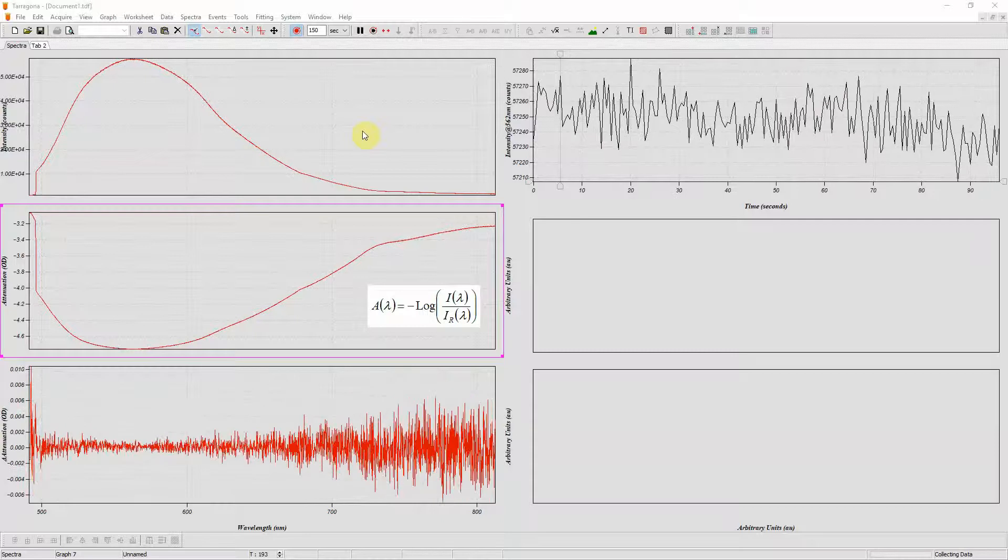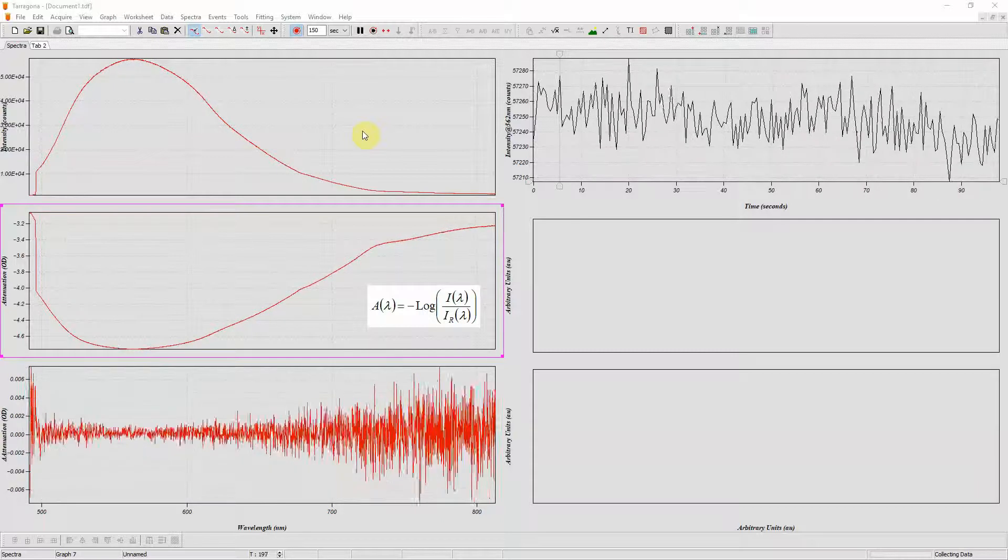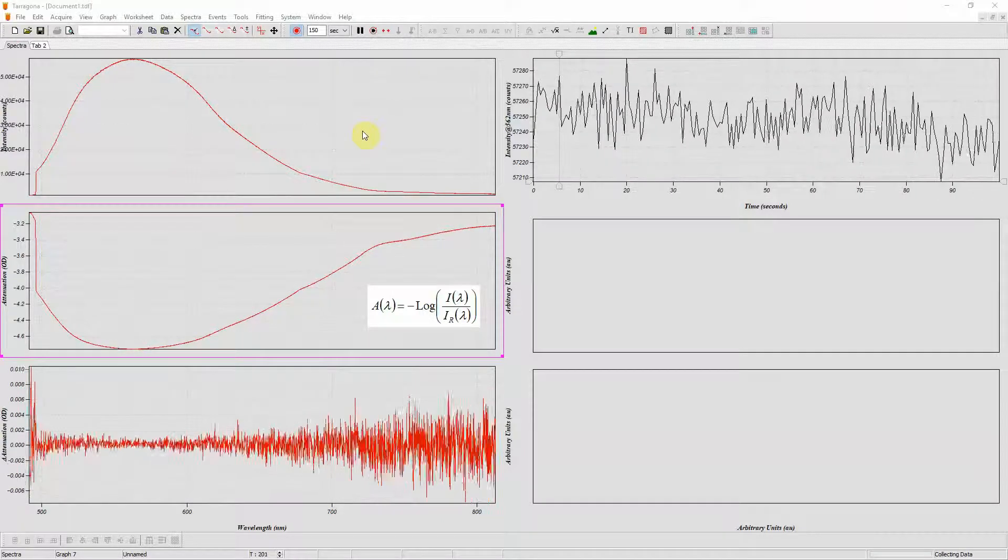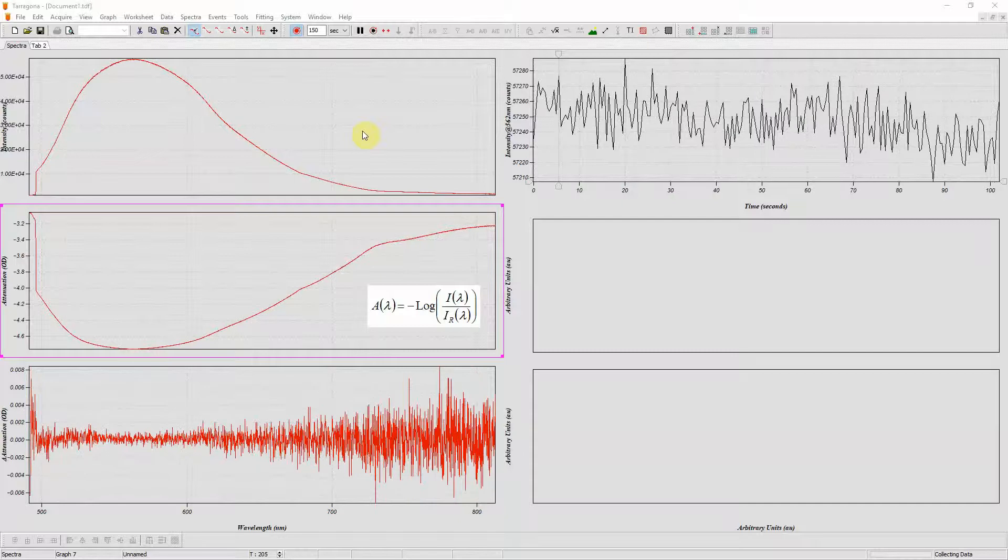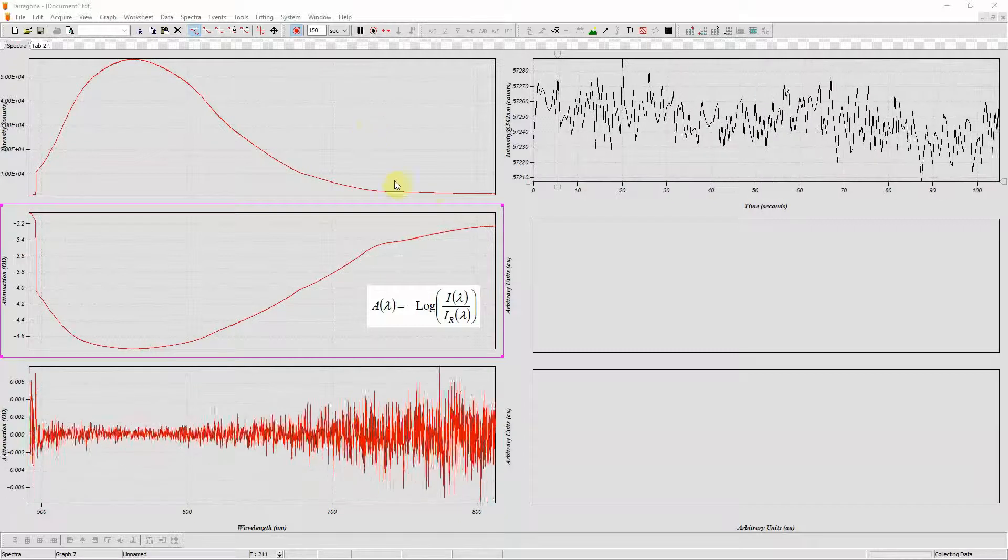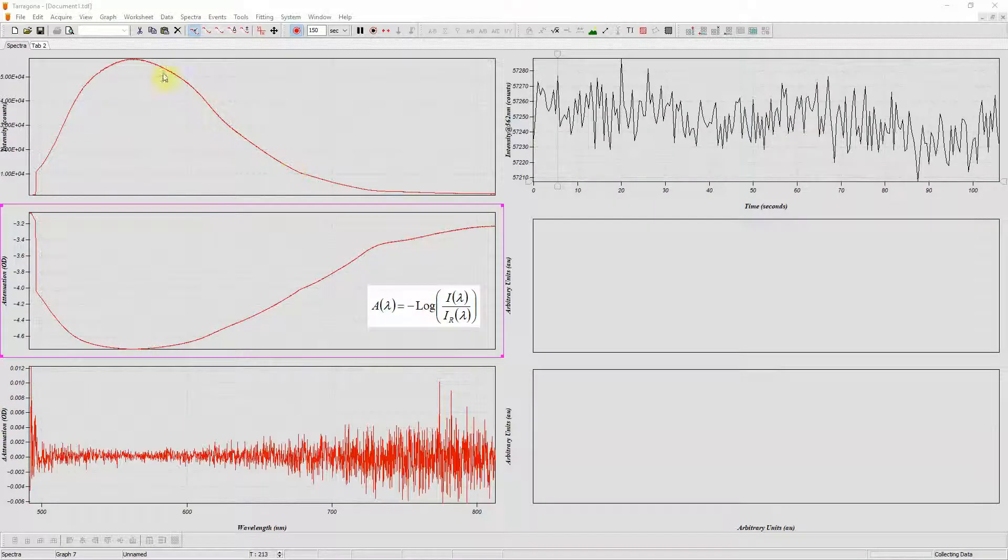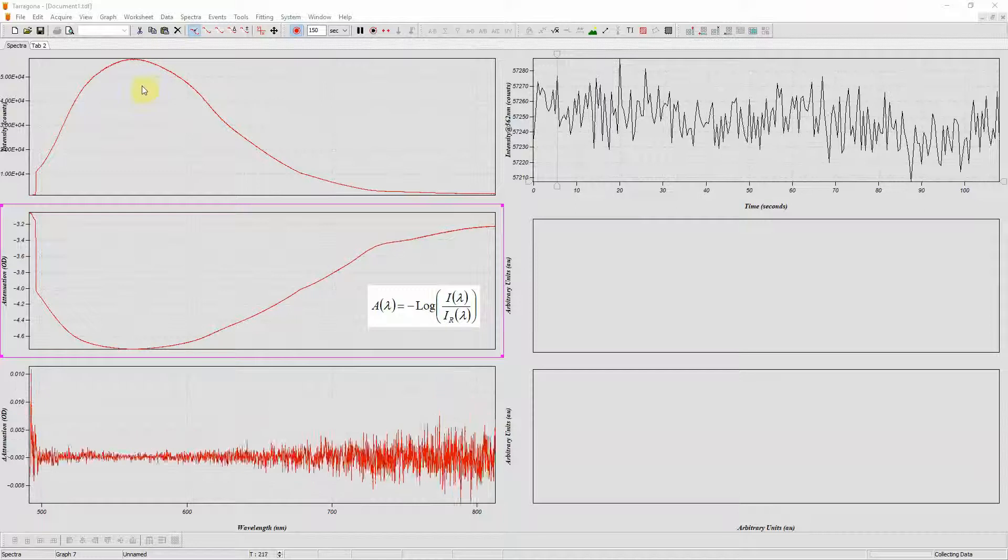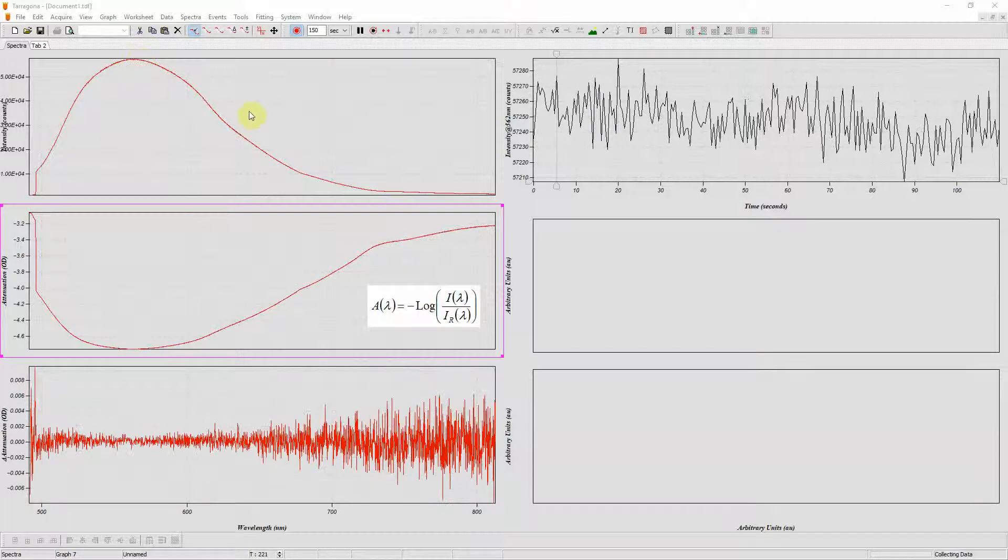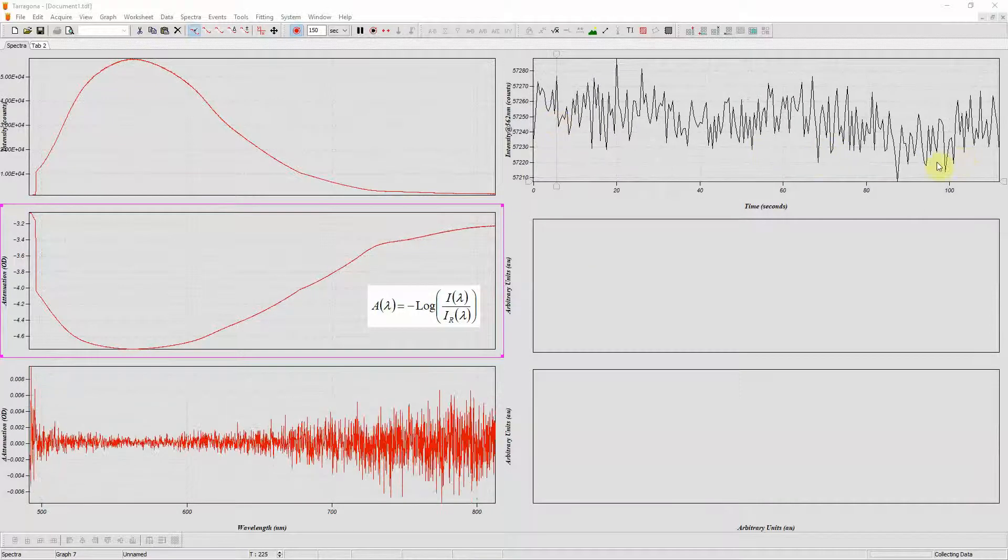I have my system set up so I'm shining light from a white LED through a 1cm cuvette and measuring the transmitted spectra with my USB 2000+. I'm plotting the intensity spectrum in this graph and I'm plotting the intensity at the peak at 562nm as a function of time in this graph.